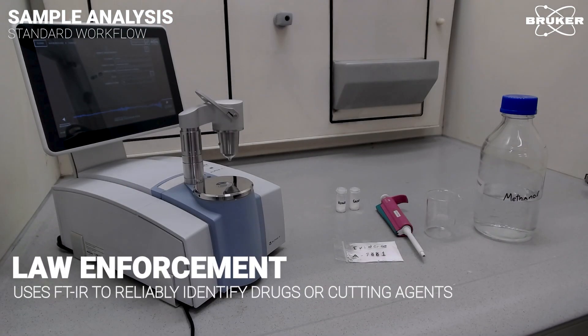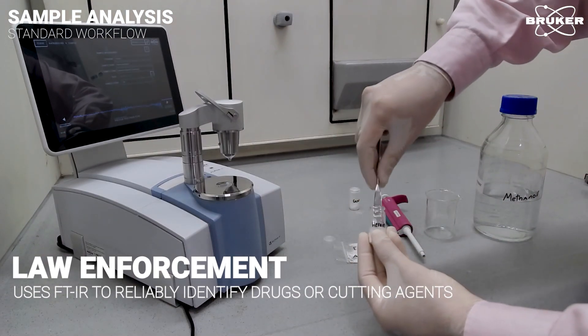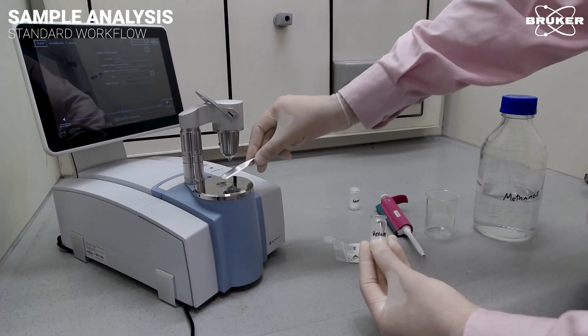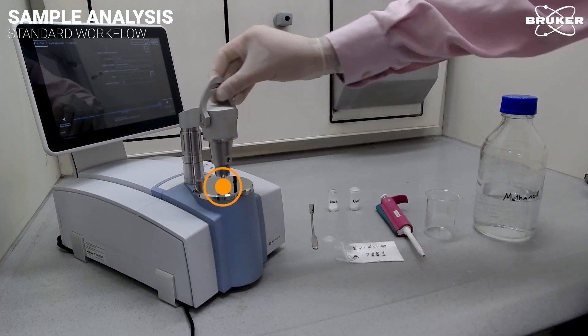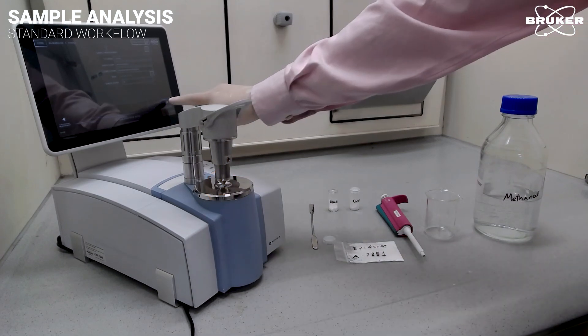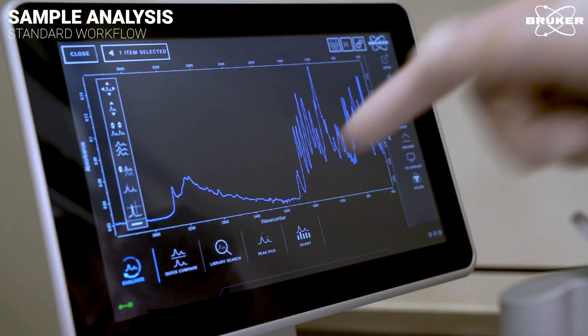Law enforcement is using infrared spectroscopy to reliably identify drugs as well as cutting or lacing agents. For such an analysis, the substance in question is simply placed on the ATR crystal of the instrument and analyzed. But since these substances often share chemical and physical properties, differentiating them can be challenging.